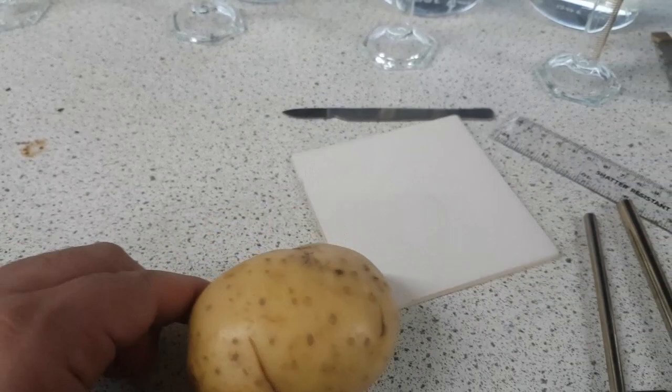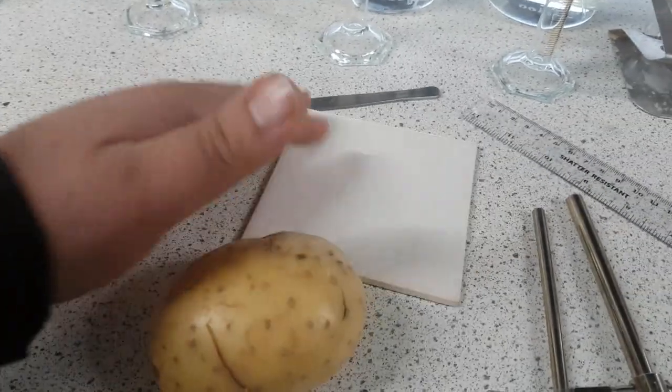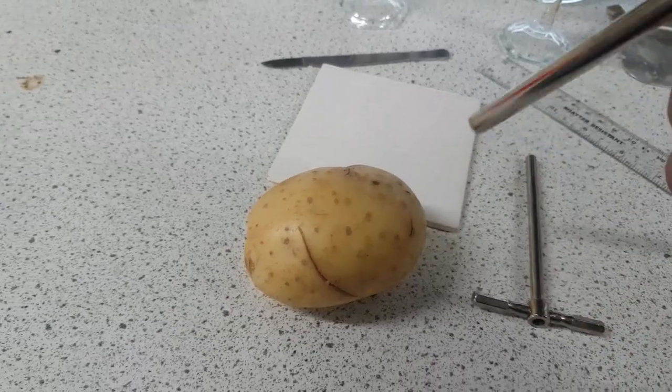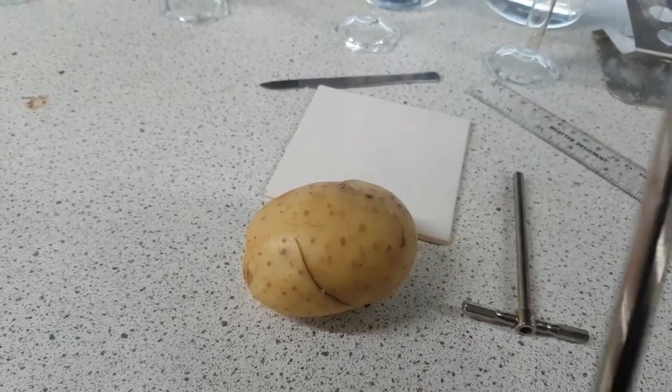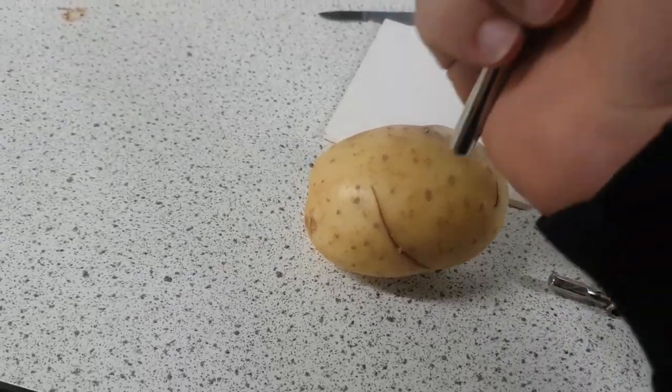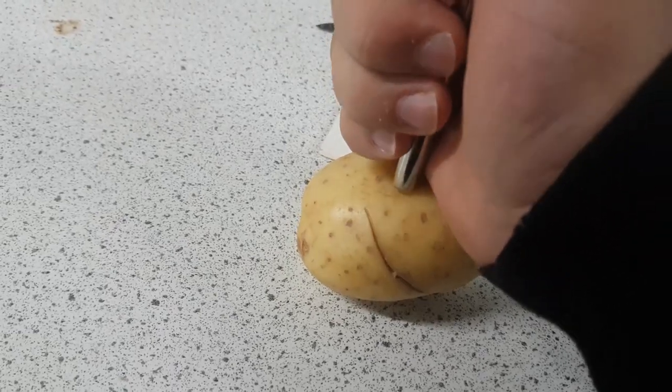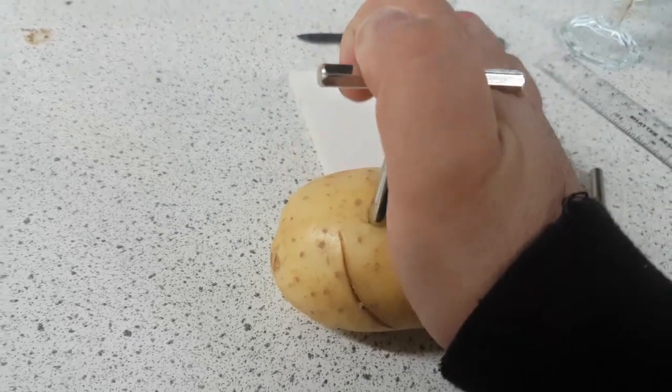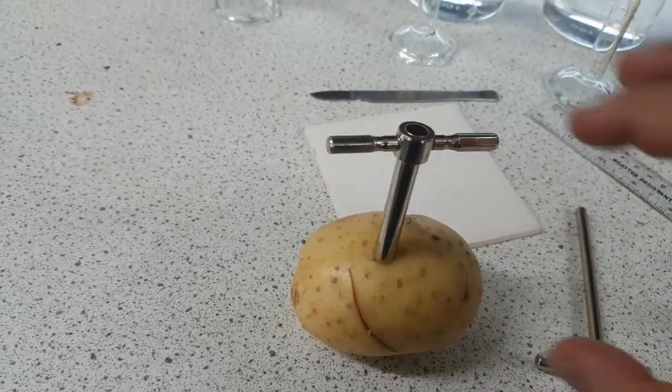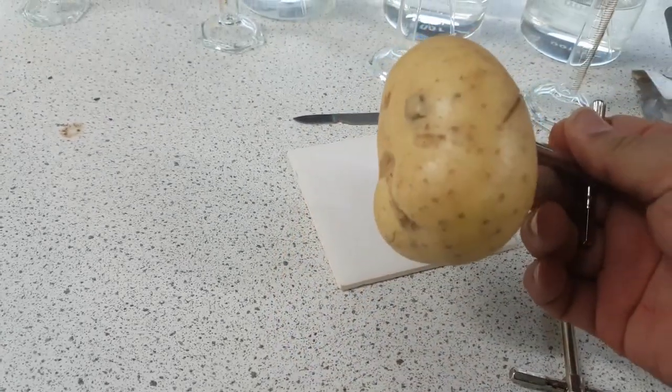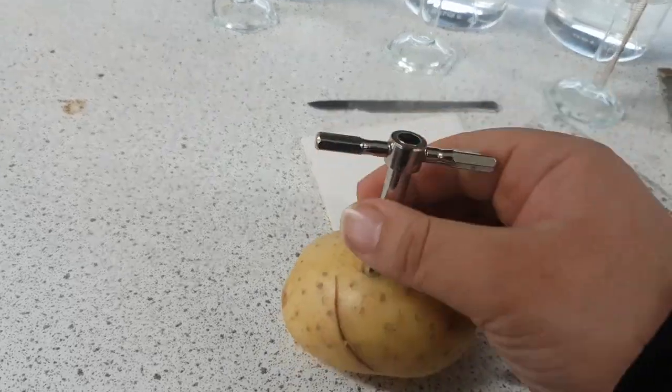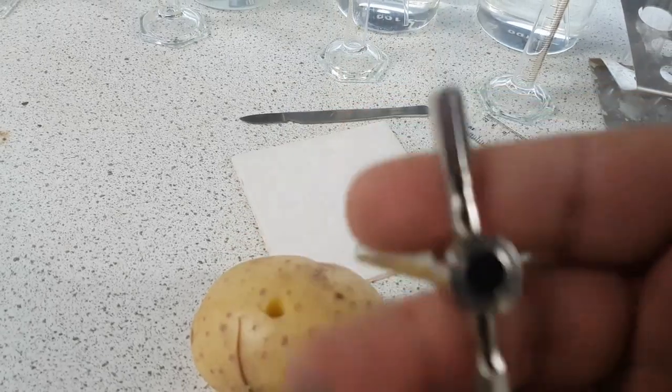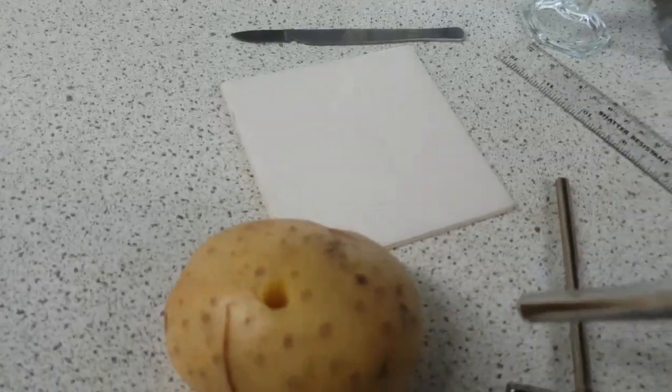So you're probably wondering what do we do with the potato. Well it's quite simple. What we do is we take the potato and we take the cork borer and we are going to press a hole into it. You've got to hold the potato firmly so that you don't end up slipping and injuring yourself. Once you've done that, you can take your cork borer out, and as you can see it's a holy potato now.